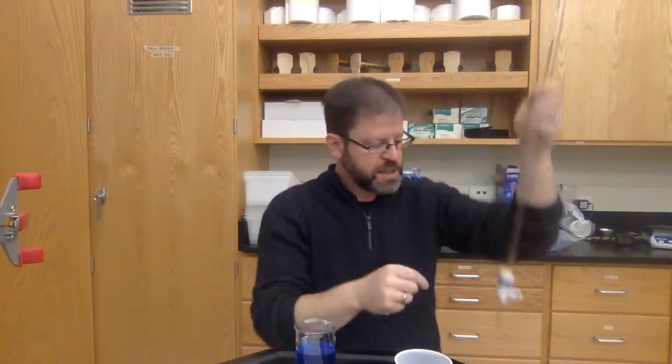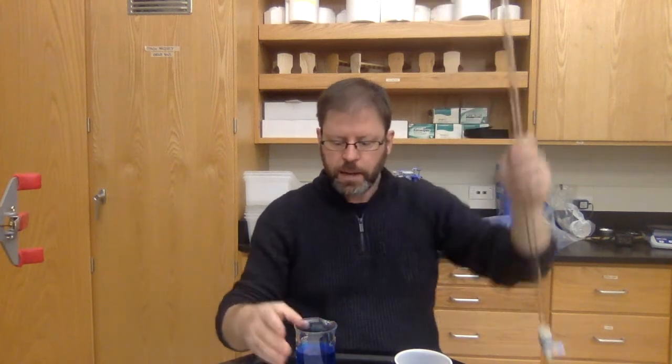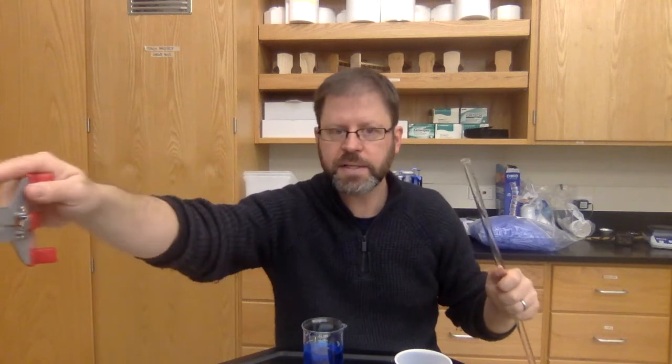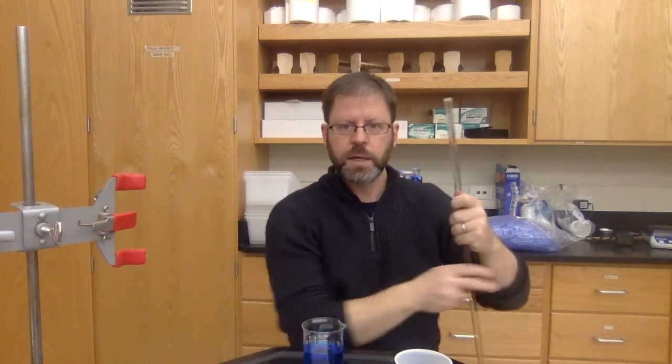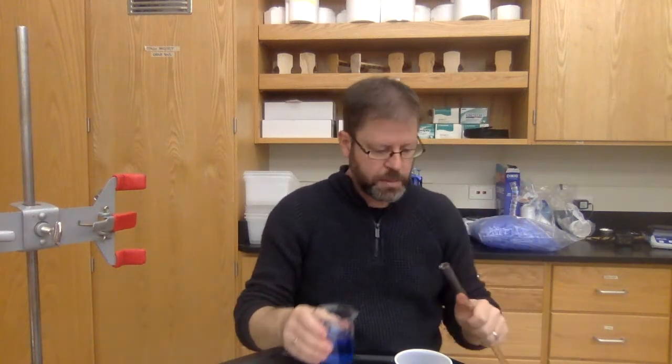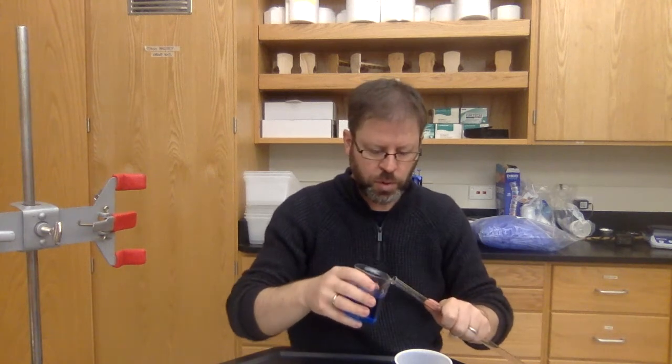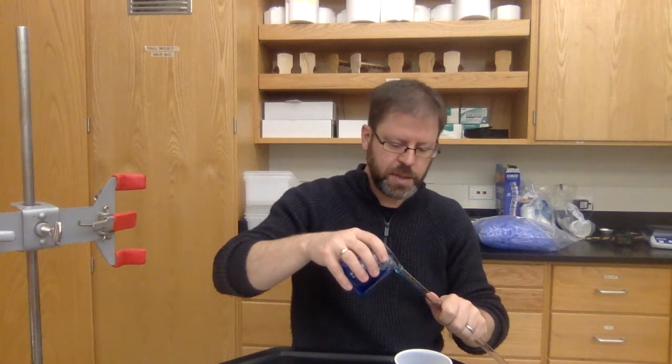Whenever you're going to fill into one of these, I have it stopped right now, and I'm going to take it down. Don't have it up in your apparatus on your ring stand. You don't want to be pouring anything above your head. So one person's going to grab some container that has a lip on it so that you can pour. This is me doing my rinse.